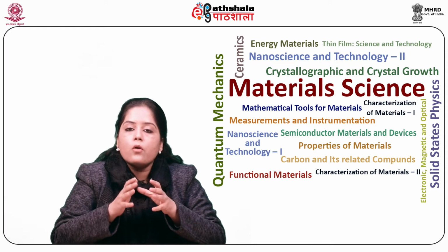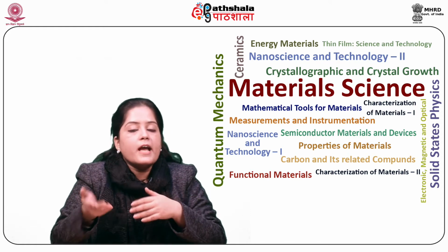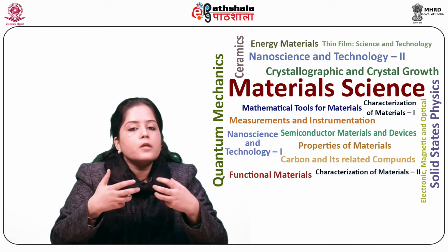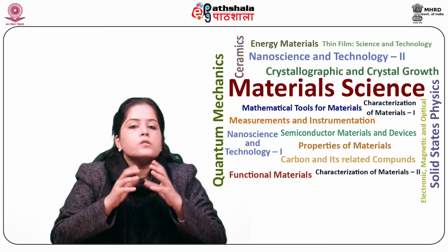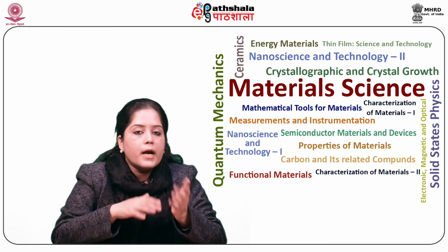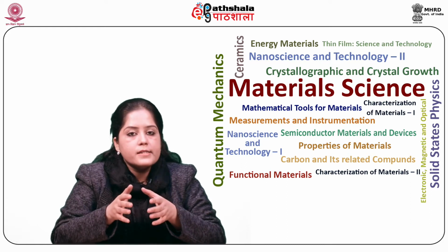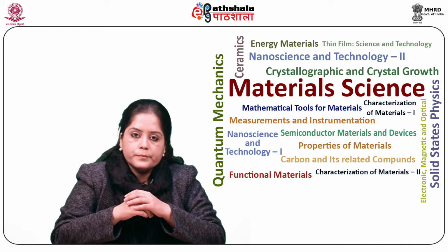Due to this unique combination of properties, researchers and engineers have been focusing on visualization of ferroelectric domains, areas with unique polarization direction at different scales. Recent advances in synthesis and fabrication of micro and nanoscale ferroelectrics brought to life new physical phenomena and devices that need to be studied and understood at this scale.